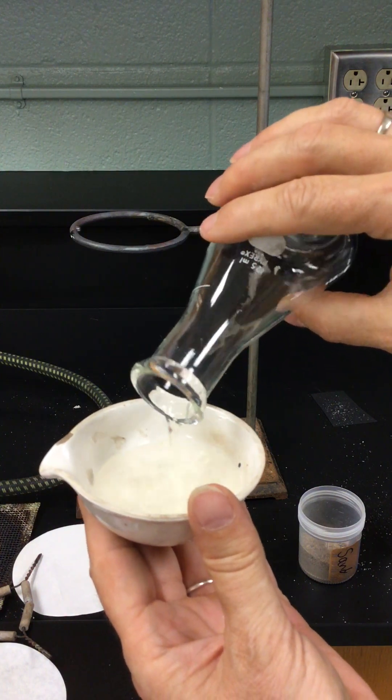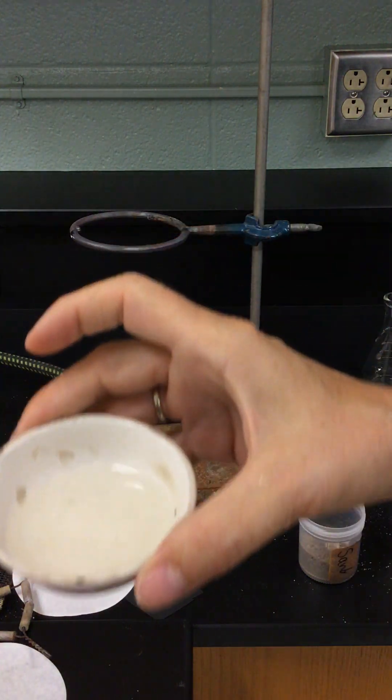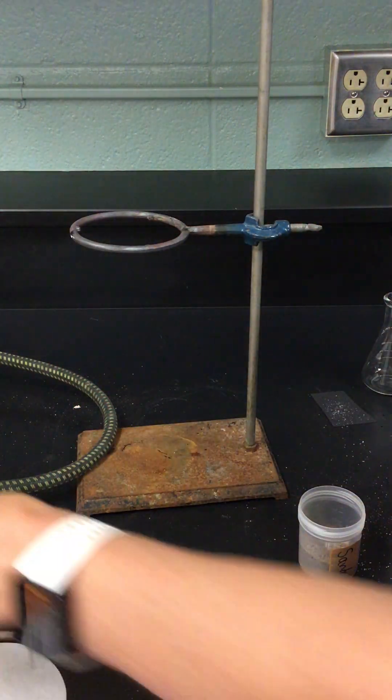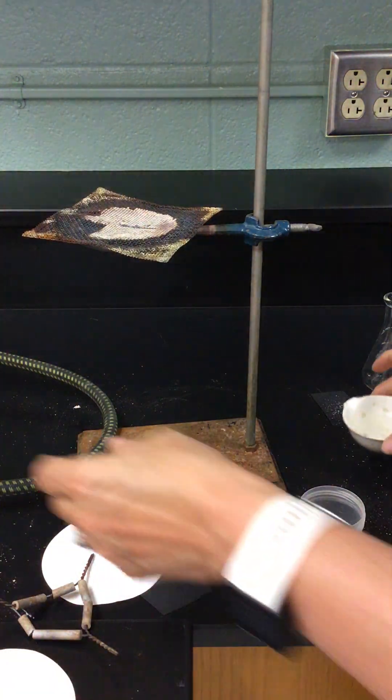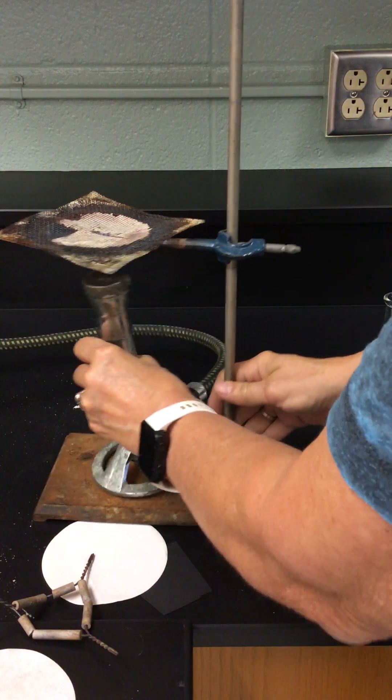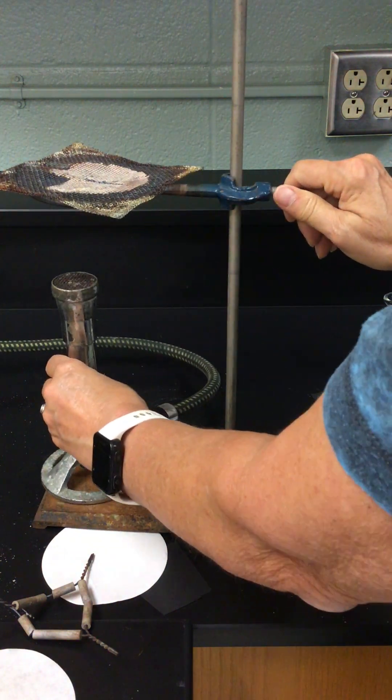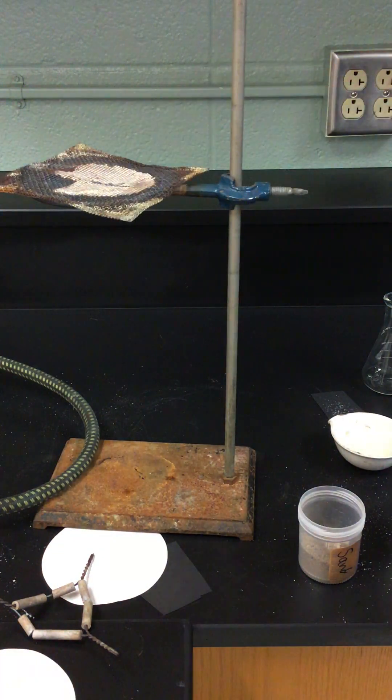We're going to put some of this filtrate into our evaporating dish. You can see if you can see what's in there, it looks just exactly like water. We're going to place this wire gauze. I got to make sure this is high enough. It is not, so I'm going to get this about so high. I'm going to put this on here.